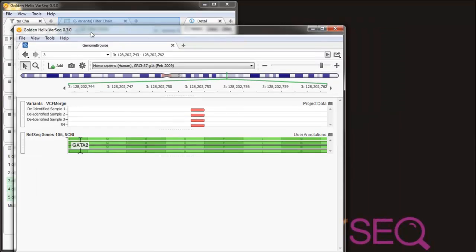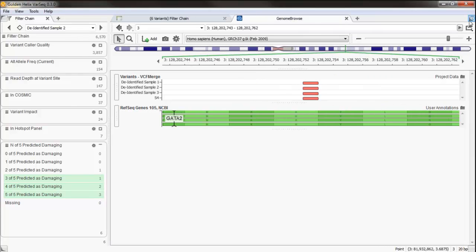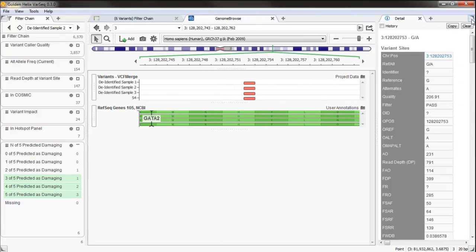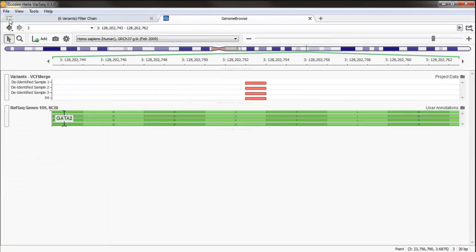Let's bring GenomeBrowse back in here, and I'm going to show you another thing that can be used to customize what I'm looking at. We call this the quick stash. In each corner of our screen, we have these little buttons, and when you click on them, it takes the closest group of tabs and stashes them in that corner. Now you can see there's a little icon showing me what's there. So it allows me to easily get things out of the way and focus on what I want.